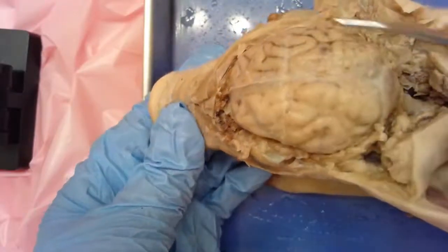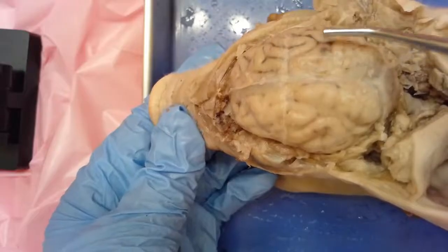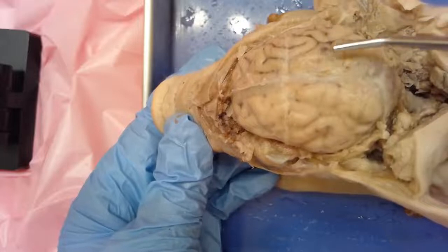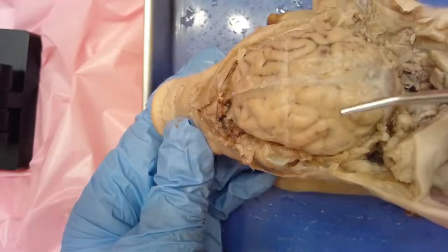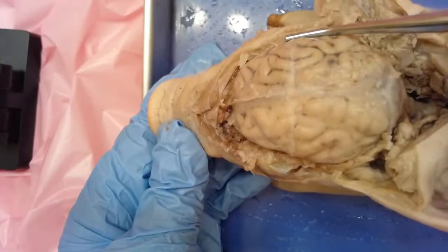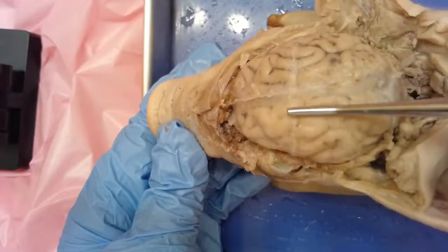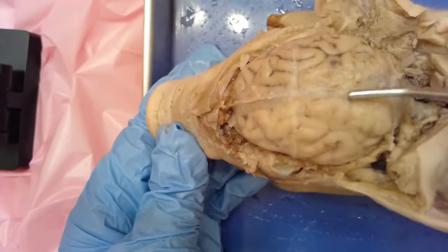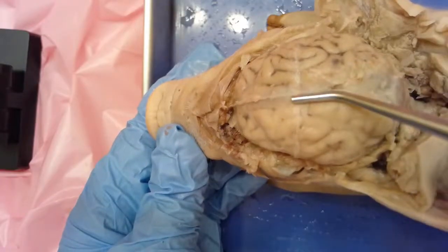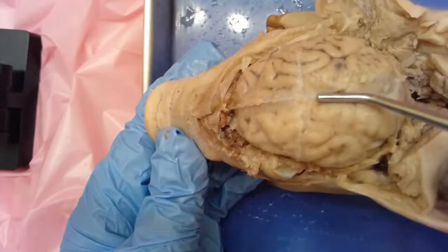The biggest area we're looking at here is the cerebrum, and it is divided into half. Just like we refer to the body using the left and right side of the pig, we're doing the same thing for the brain. So this is the pig's right cerebral hemisphere, and this is the pig's left cerebral hemisphere. Down the center is this dividing line that we call the longitudinal cerebral fissure.